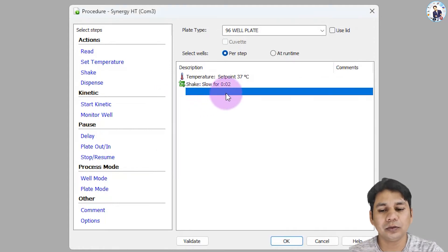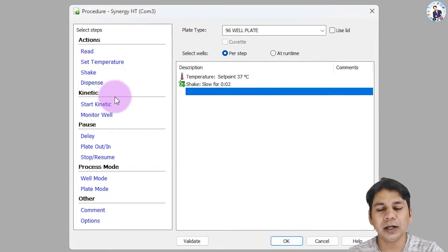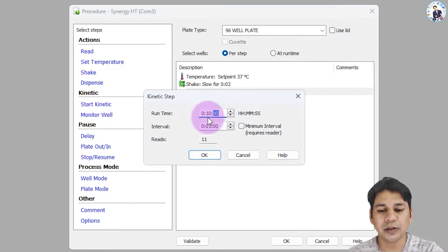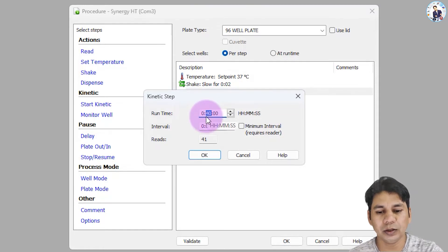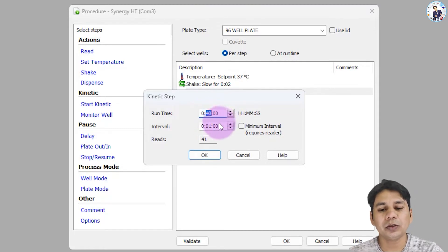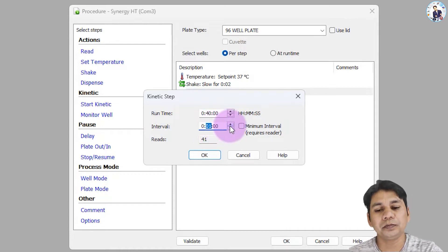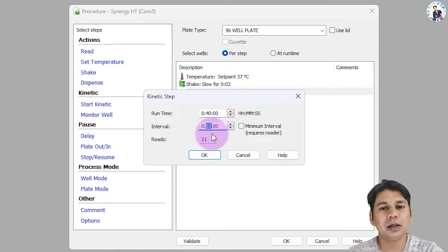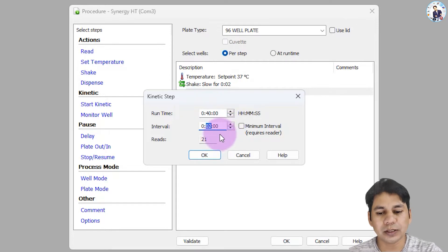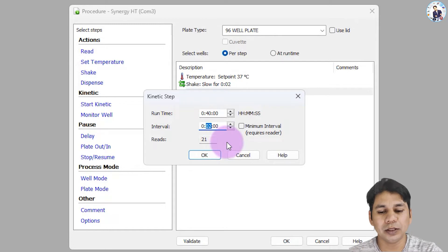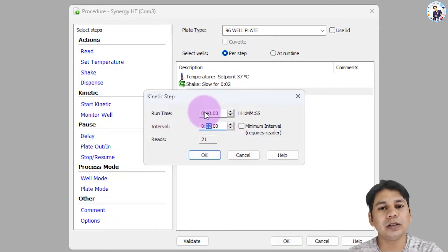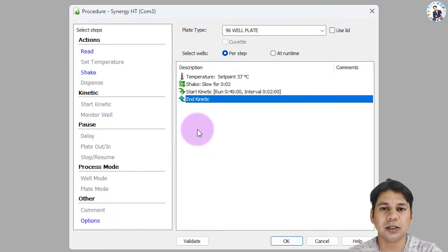For the kinetic setup, click on 'Start Kinetics.' This assay needs 40 minutes to take the absorbance, so I am selecting 40 minutes. The time interval for this assay is two minutes, and the machine will take the absorbance after every two minutes. You can see that a total of 21 reads will be taken by the machine for this assay.